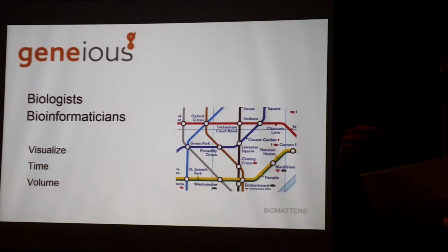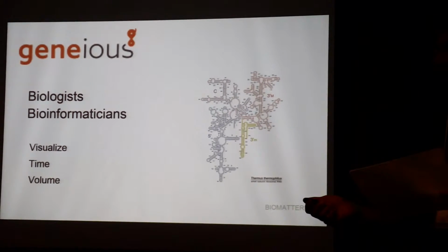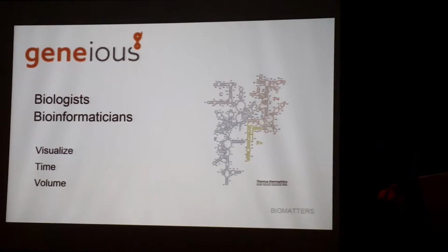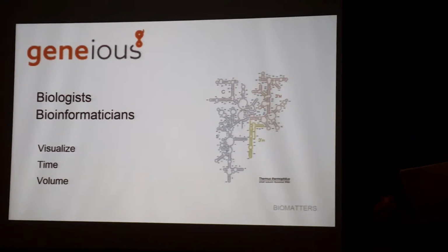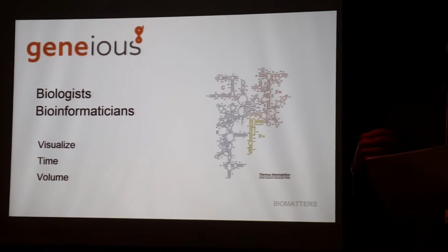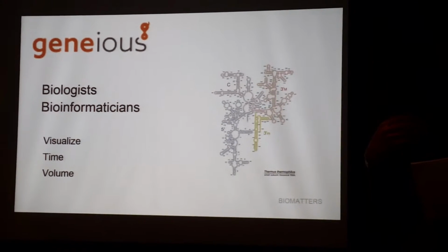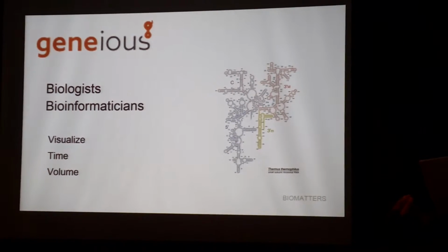Now, what's the connection between the London Tube and biology? Some of you may have seen this, which is a slightly off, but 16S map, right? And it's much the same way. So when biologists want to understand the biodiversity of a sample, they bring a lot of contextual information to that, something that can't always be translated to biologists or bioinformaticians. So that's one big problem, just bringing in contextual information, the background information, what are the specifics, what are the nuances to a specific project.